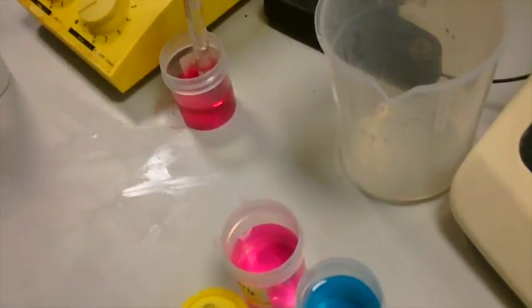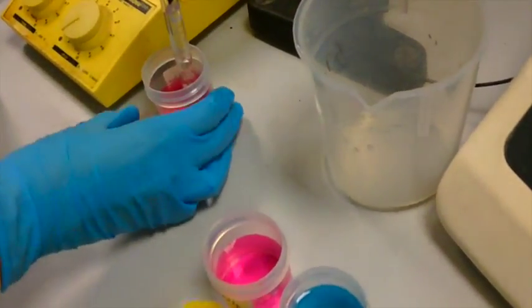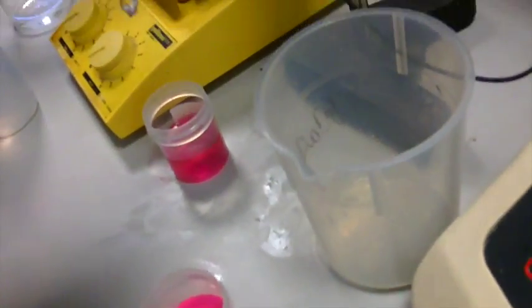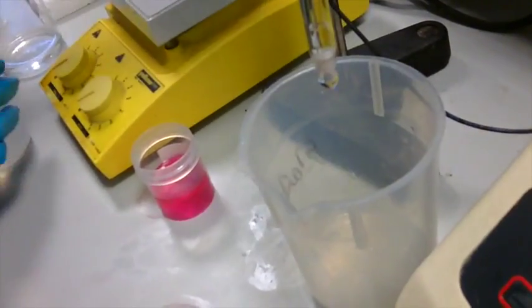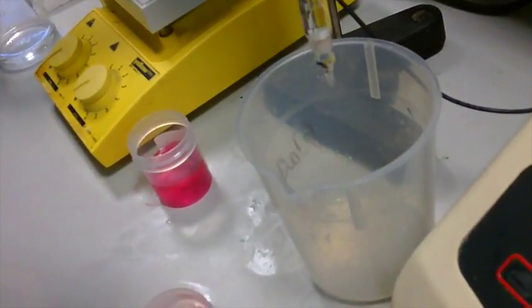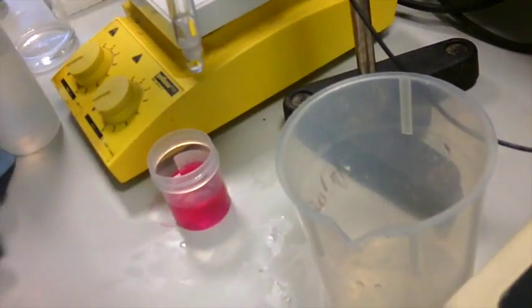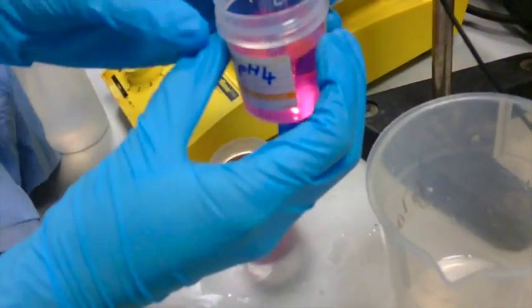Before you measure your pH solution, it has to be calibrated. In order to do this, the probe is removed from the storage solution, washed briefly with water into a waste bucket and then dried with a piece of tissue. It is then inserted into the pH 4 solution.